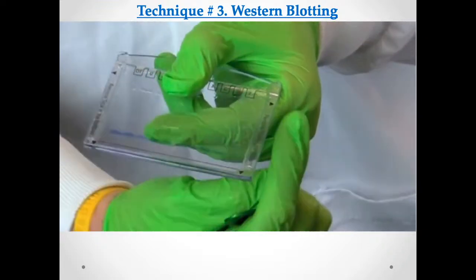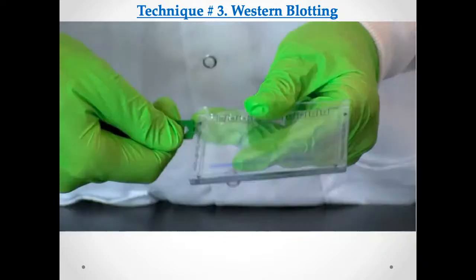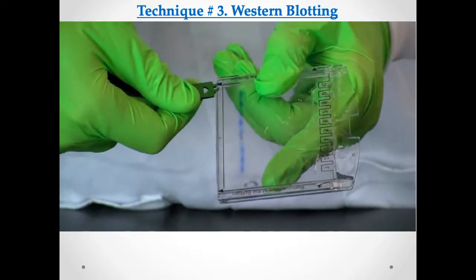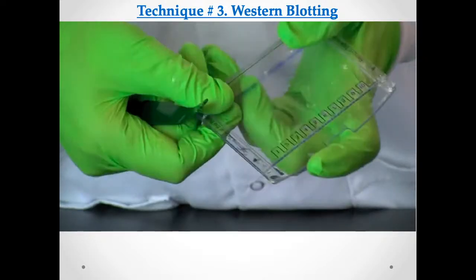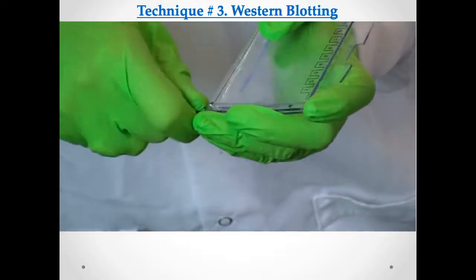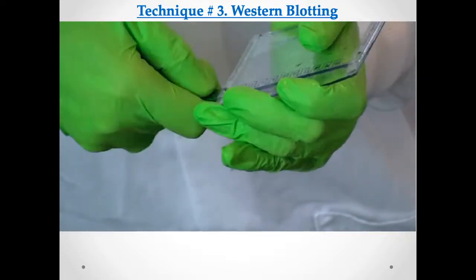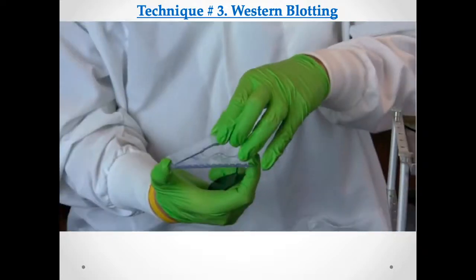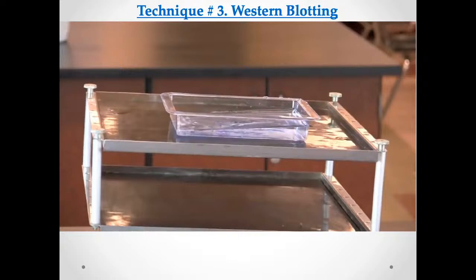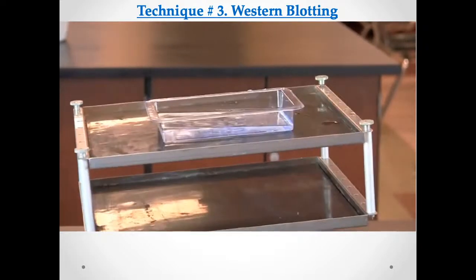Next, remove the gel from the gel cassette using the opening key. Line up the arrows on the opening lever with the four arrows on the cassette to open the cassette. After trimming the top and bottom of the gel with a straight edge, equilibrate the gel in the tray with blotting buffer for 15 minutes on a rocking platform.